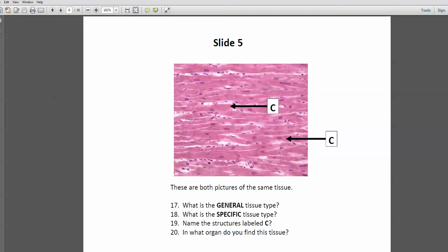Okay, slide number 5. So you should notice the banding, the bands. They're a little more difficult to see compared to the couple of slides back, but there are bands here, striations. So this is muscle tissue. And C is asking you to identify that little structure there, those little line-looking structures, which are called intercalated discs. And there's only one tissue that has intercalated discs, and that is cardiac muscle tissue. And that's what we're looking at.